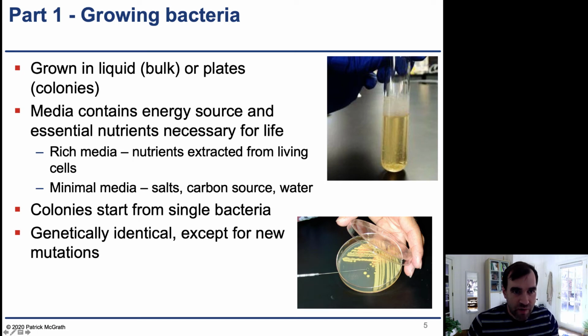All right, so growing bacteria. So how do you grow bacteria? One of the things that's different about bacteria versus fruit flies is that with fruit flies, typically you only want to have one or two in order to phenotype, or maybe you're doing a huge genetic experiment and you want to look at thousands of Drosophila flies.